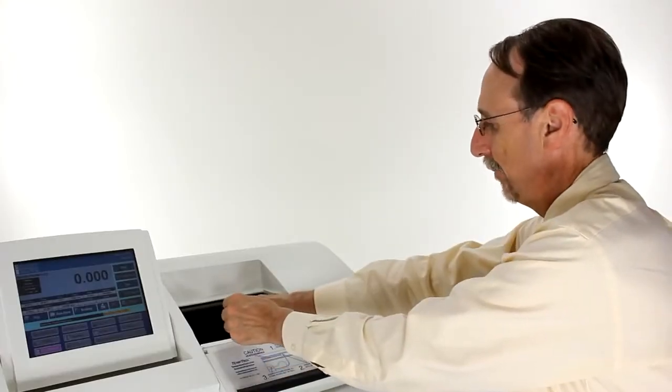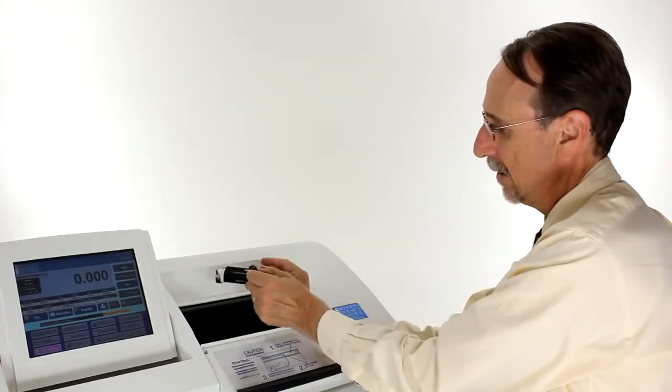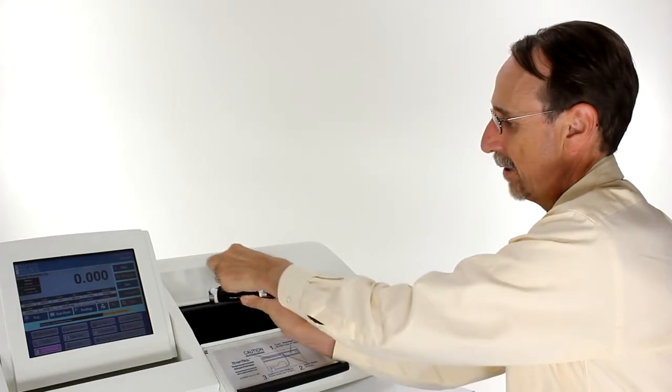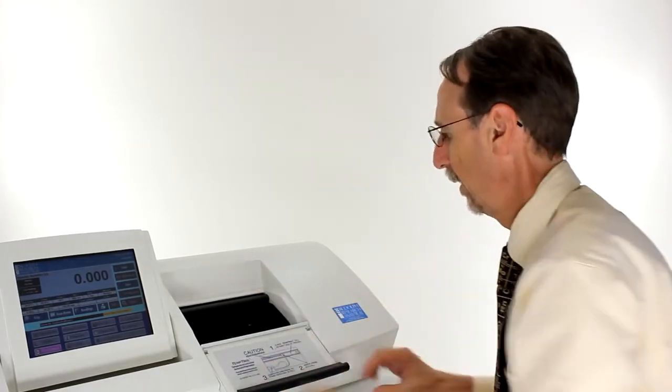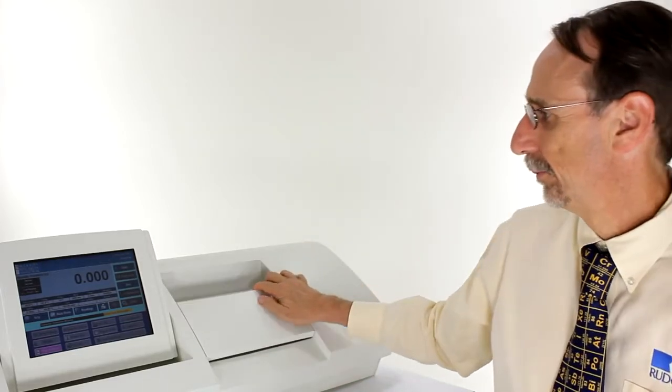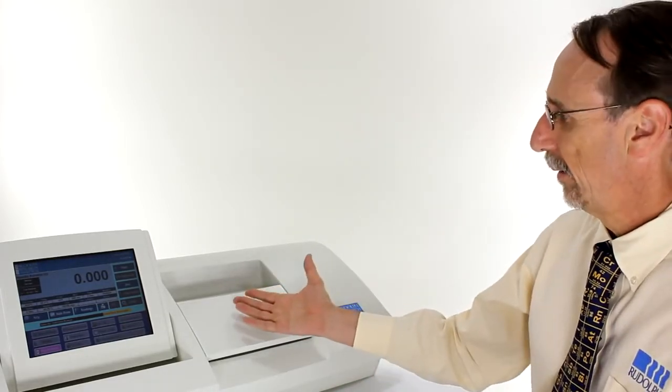I'll lift the temperature sensor. I'm going to place the temperature sensor inside the cell. The temperature sensor goes in this small hole at the back of the cell. Close the door and we're now ready to blank the instrument.